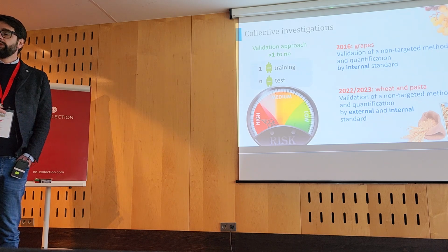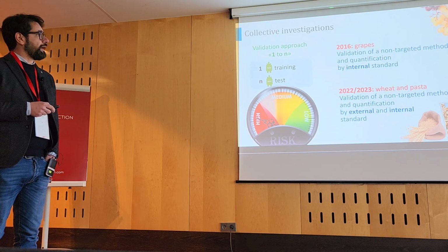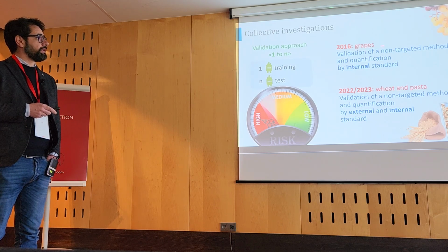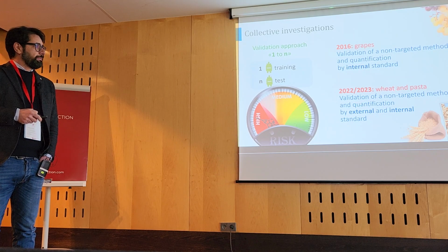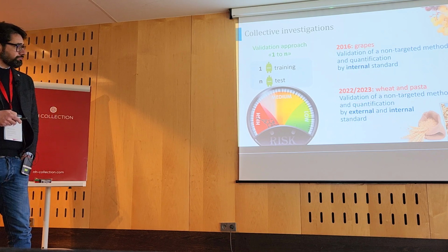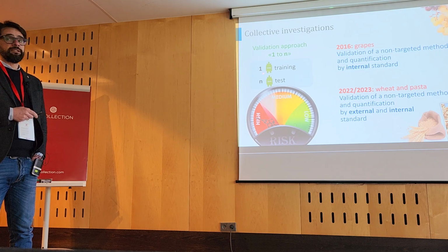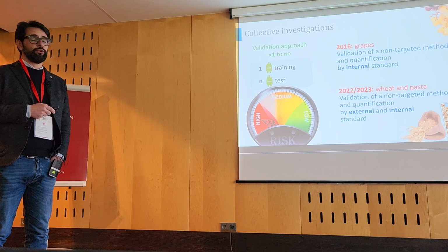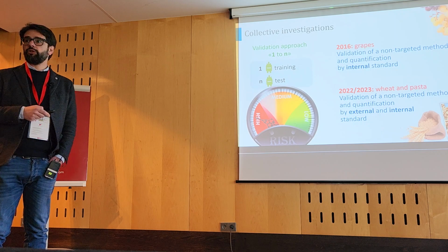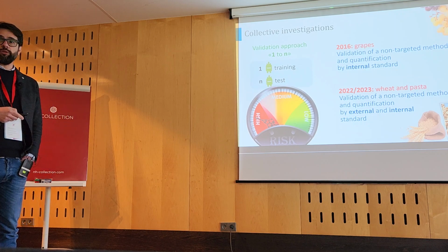We organized 2 different interlaboratory comparisons. One using grapes as samples, and the other one, the recent one, with wheat and pasta. In these studies, one NMR spectrometer, our spectrometer, produced the spectra for training, and the other spectrometers analyzed the same samples and were used as a test.